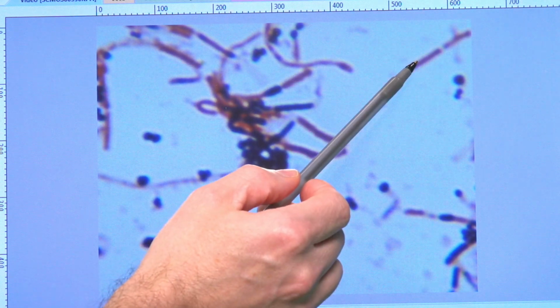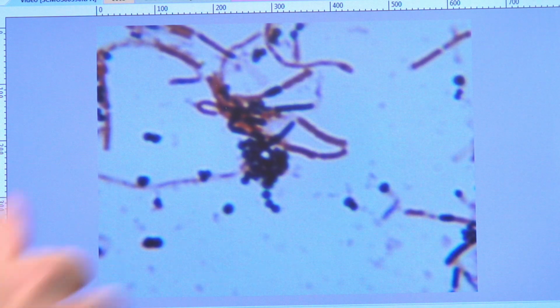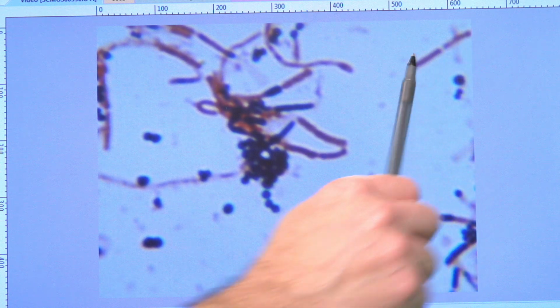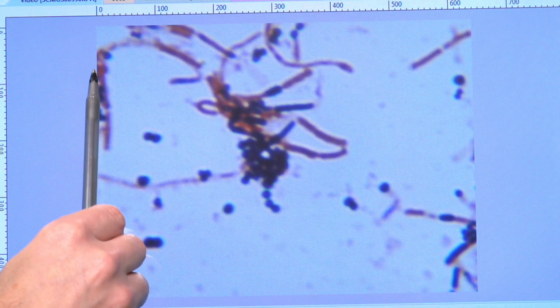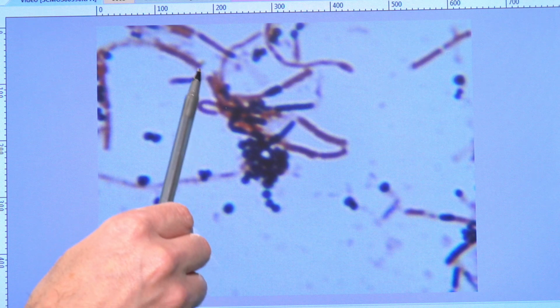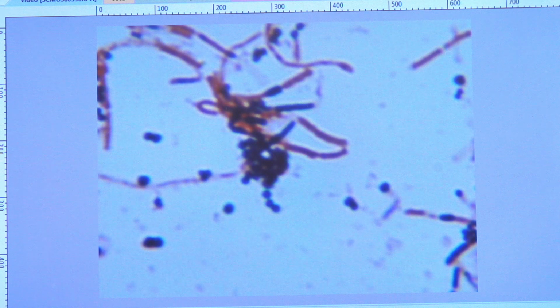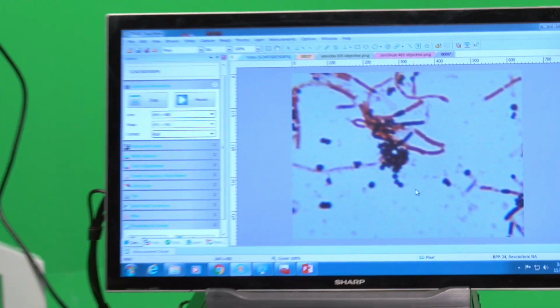The fact that you've got a bacillus with a bacillus, that would be a diplobacillus. Since we've got bacillus after bacillus after bacillus after bacillus, that is a streptobacillus. And so what you would want to do is go ahead and snap that, and save this, and then put arrows and put diplococcus, coccus, diplobacillus, etc. And that's how you would go ahead and classify these.